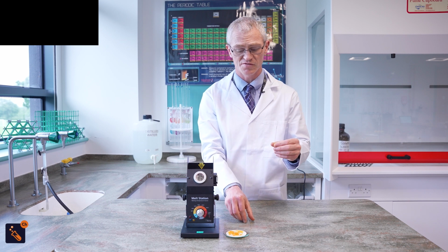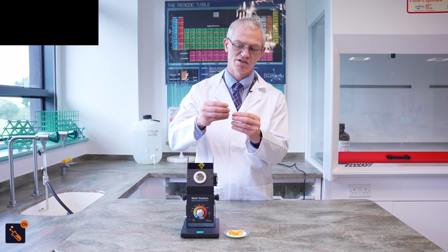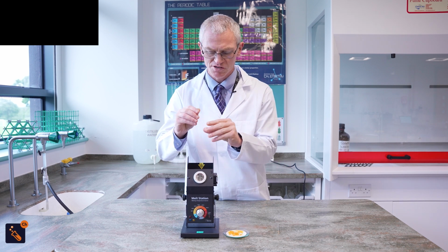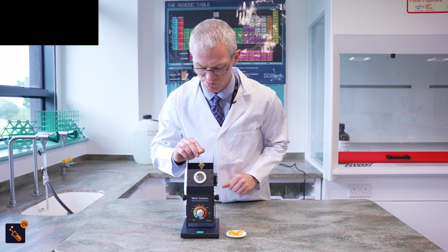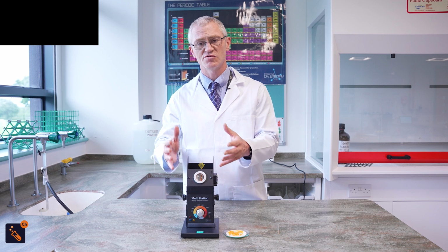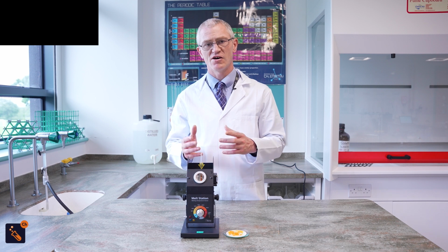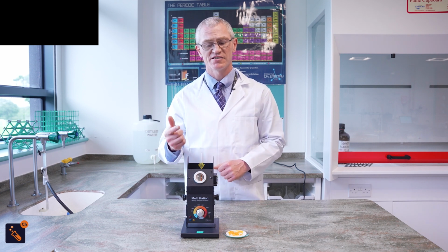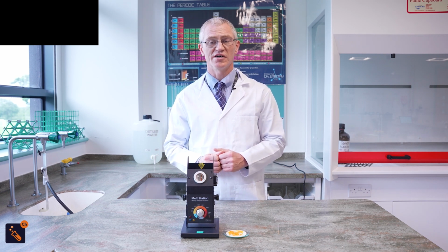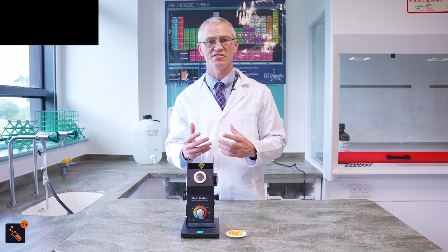As with a kind of Blue Peter moment, you have a pre-prepared tube here which has your solid in the bottom. All you do is take that and put it into your melting point device, and lots of schools have devices like this, and then you set it to around about the temperature which you feel that it's going to melt. Now all we do is look at the window, and as we look in the window we'll see what it looks like when the 2,4-DNPH derivative melts, and we'll monitor the temperature.